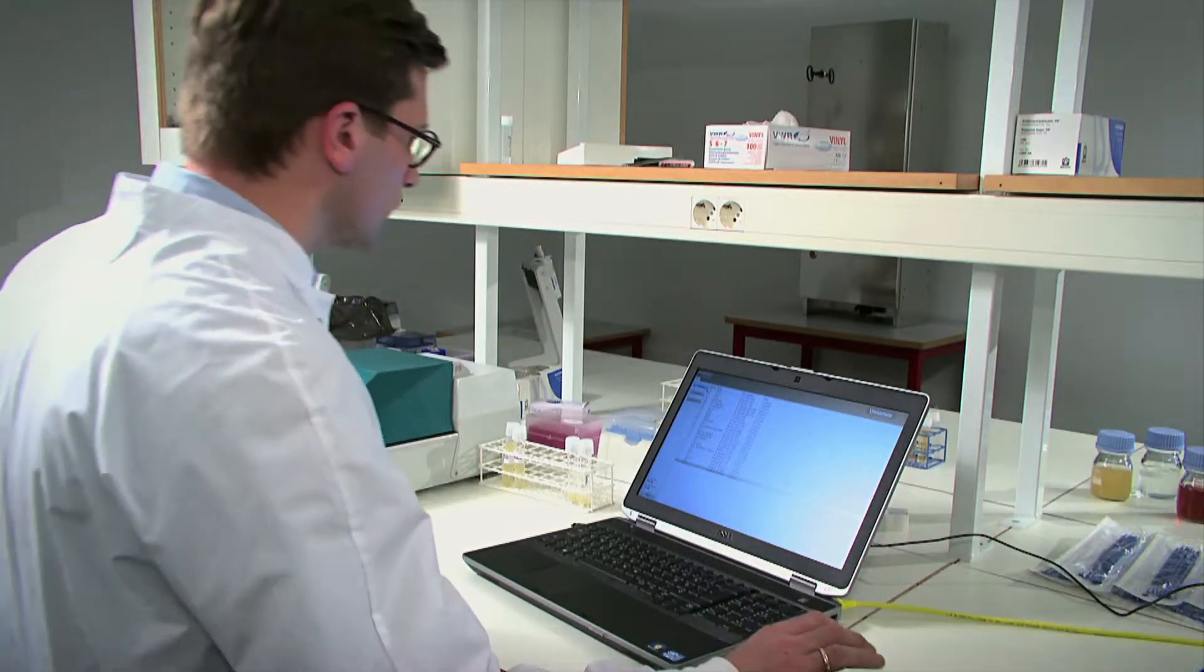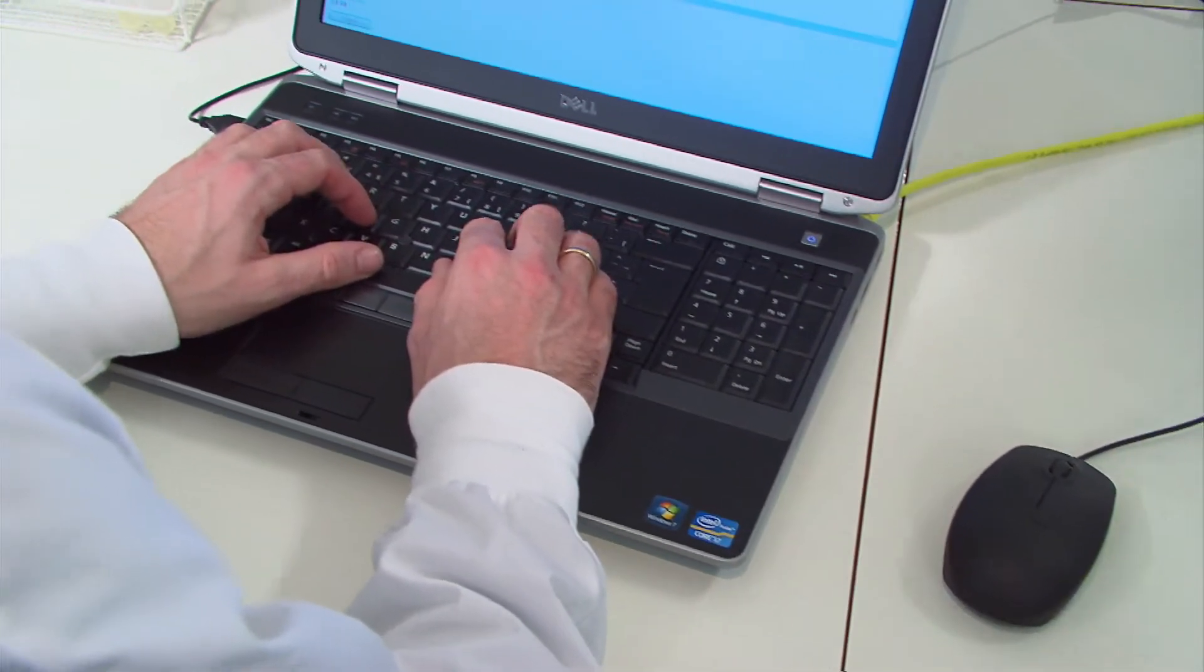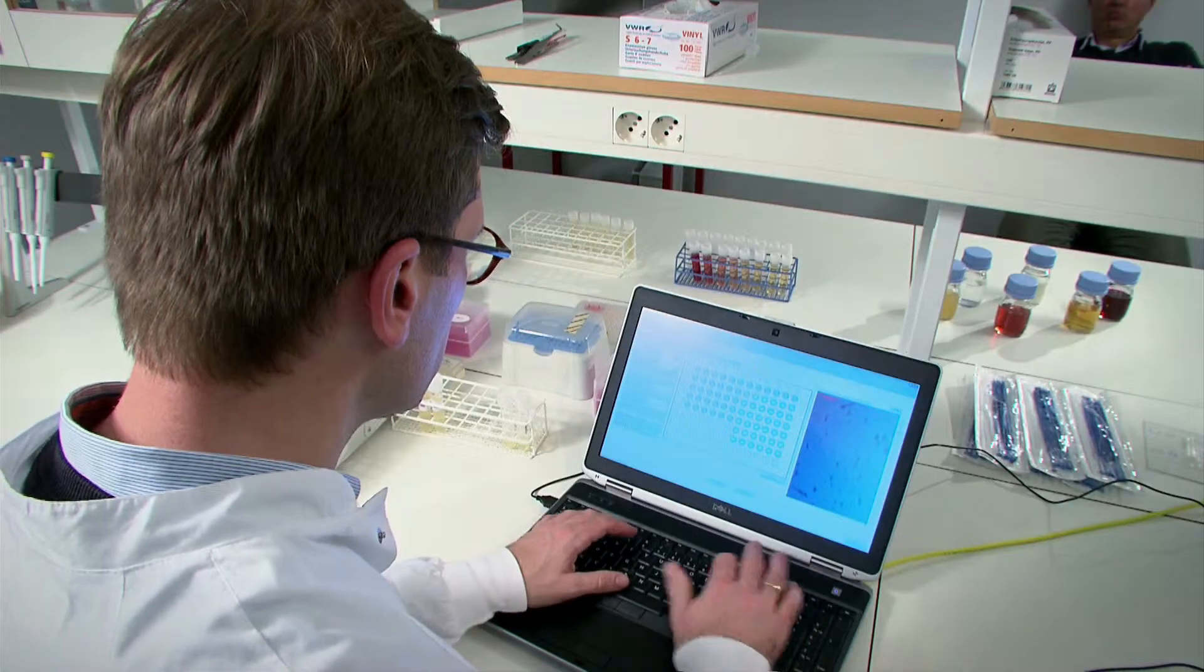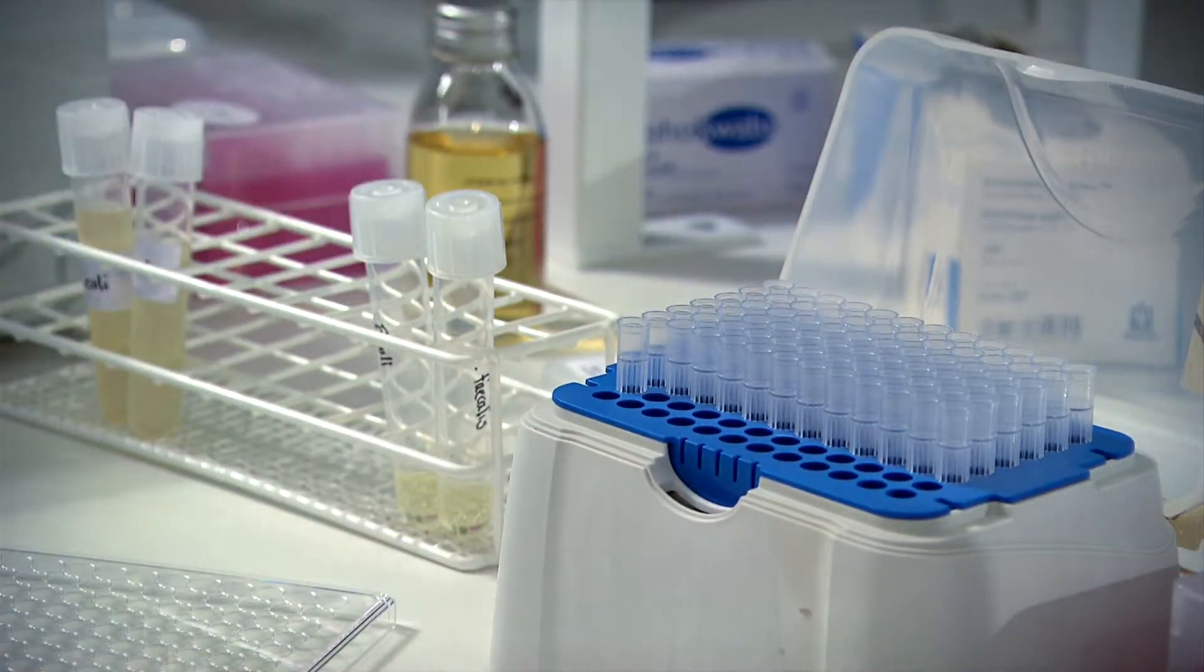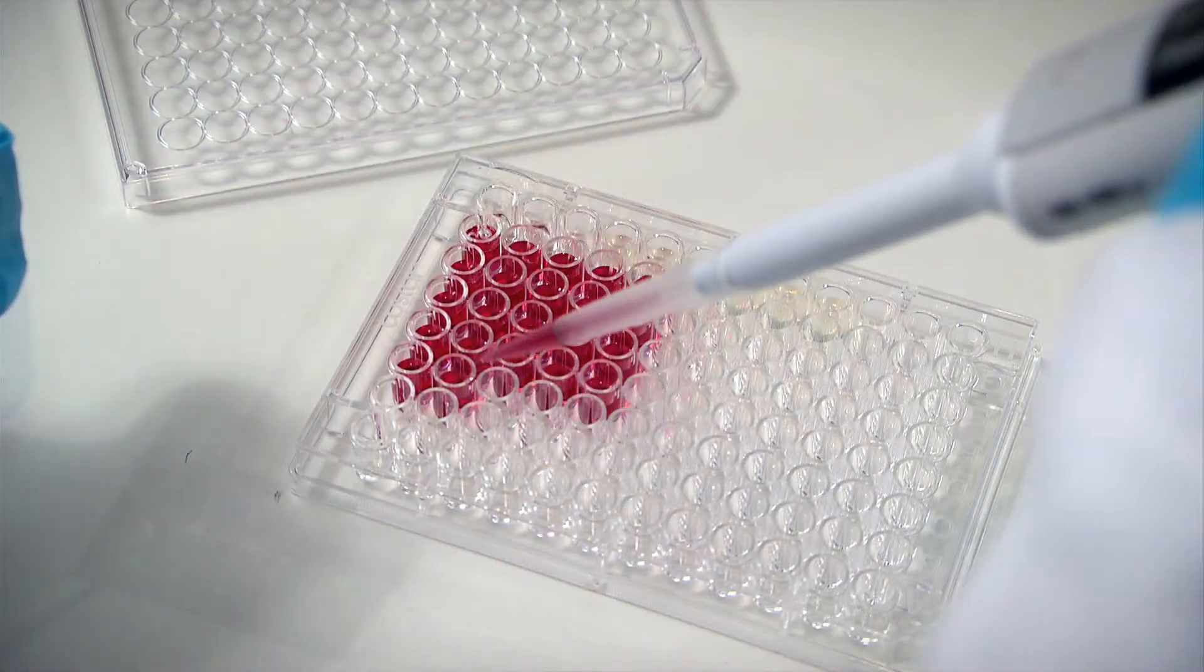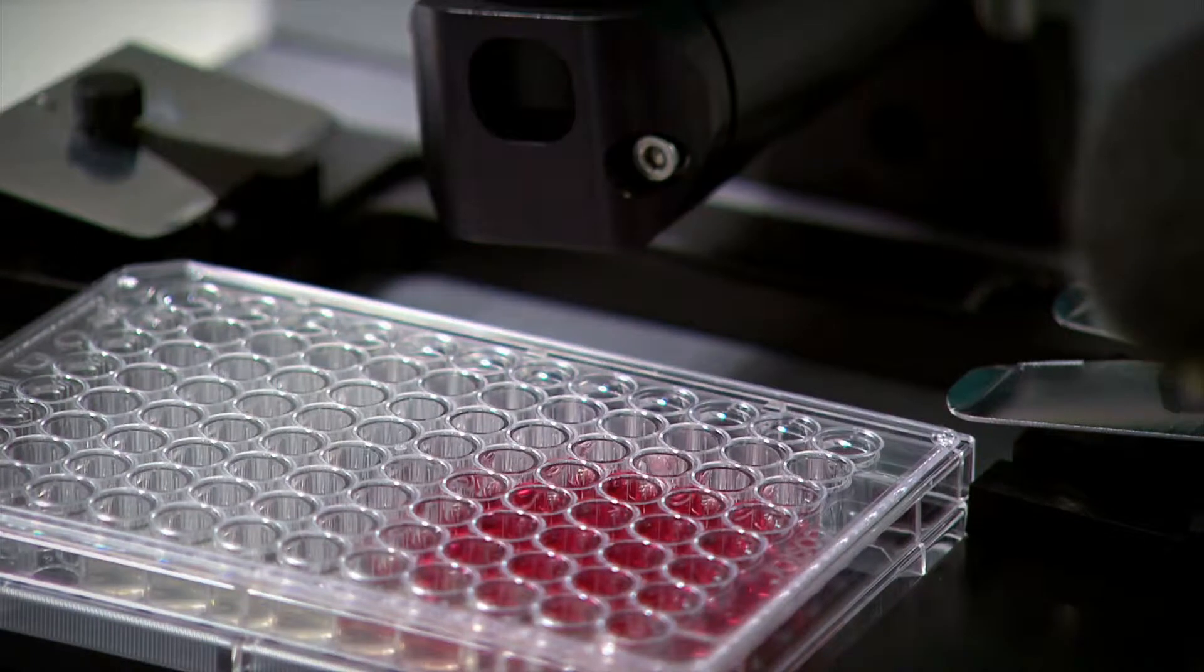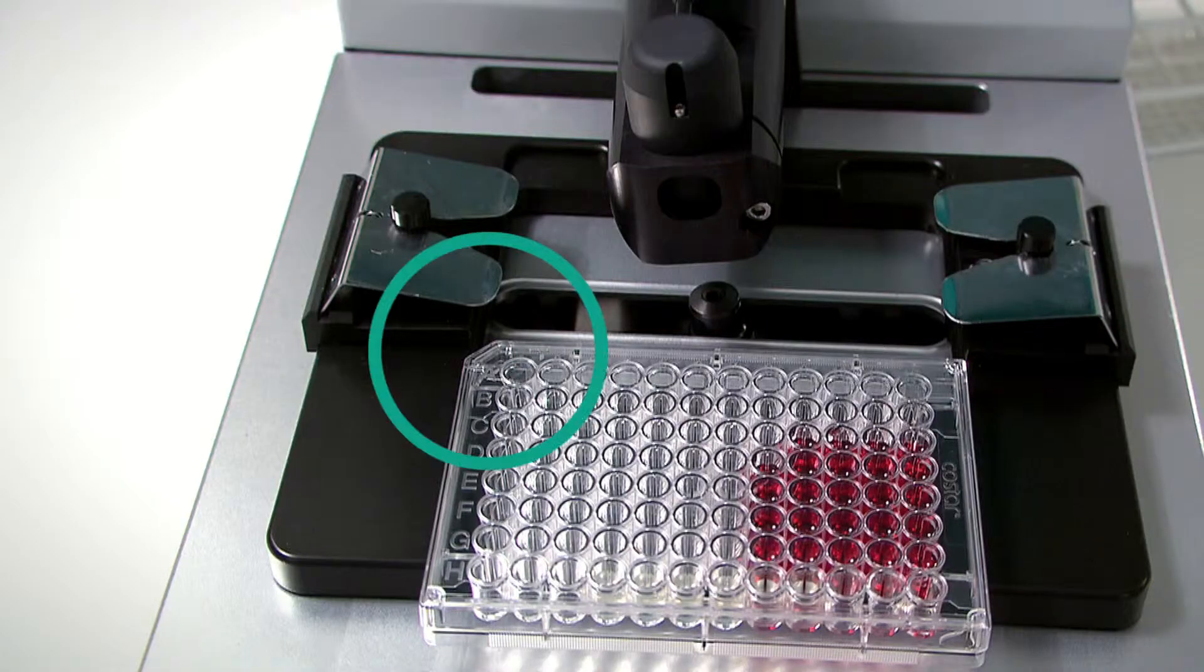Ocelloscope is run and monitored using a standard PC and only requires a normal network cable to connect Ocelloscope to the PC. The sample that has to be analyzed is pipetted into the microtiter plate. The microtiter plate is then inserted into Ocelloscope with well A1 at the upper left position.